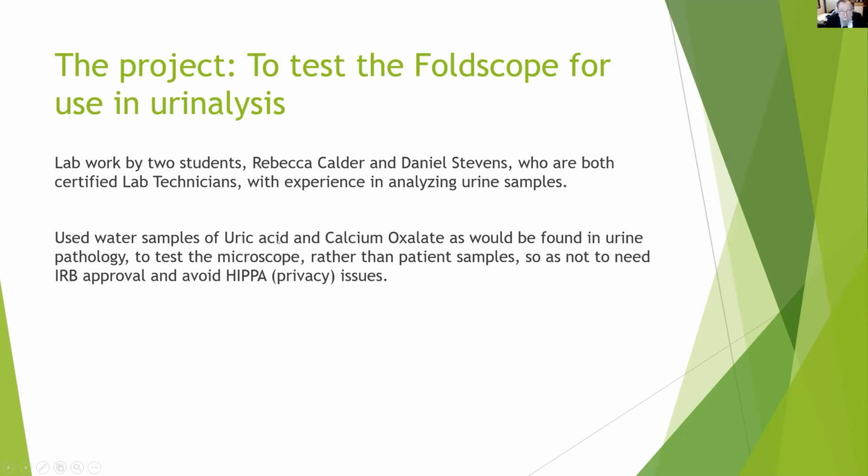We used water samples of uric acid and calcium oxalate, as would be found in real urine pathology. The primary goal was to test the microscope, and we did that rather than use patient samples so as not to need institutional review board approval and HIPAA, which is privacy issues, patient samples, and so on.